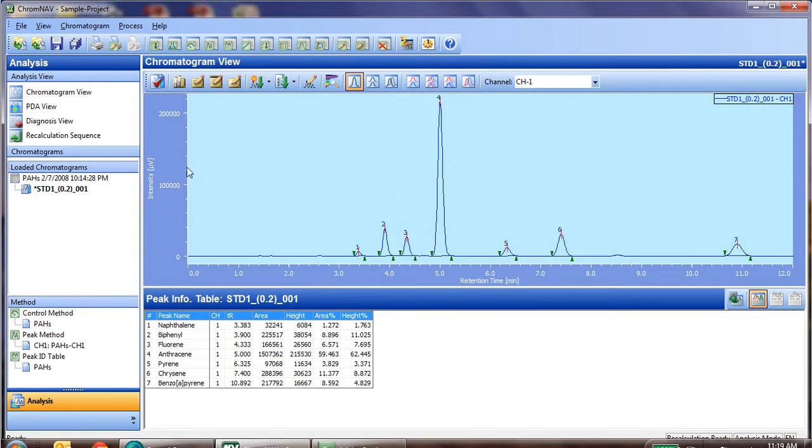And now, it has applied that system test, and of course, we need to add a column into our peak table so that we can see the results.